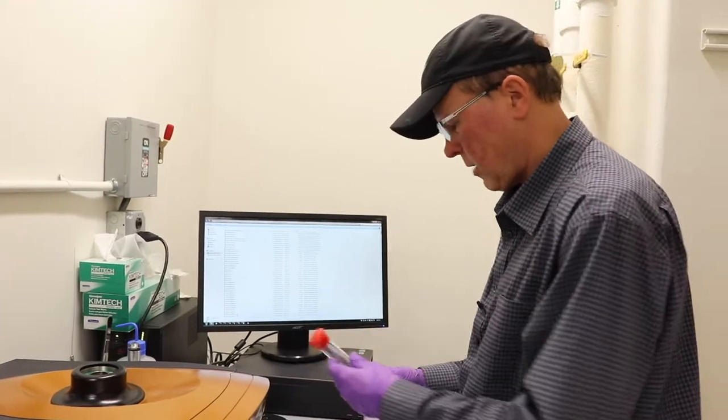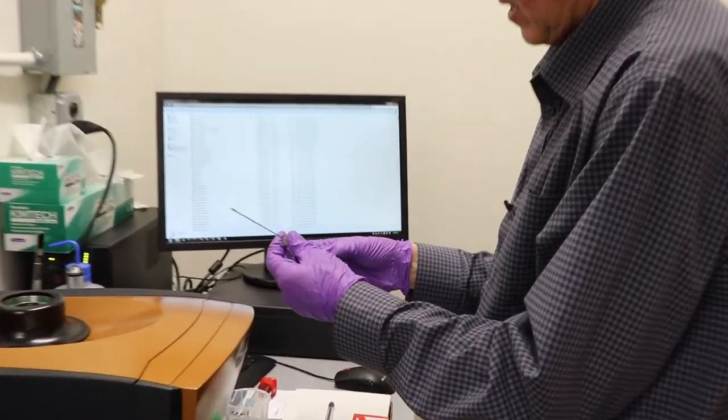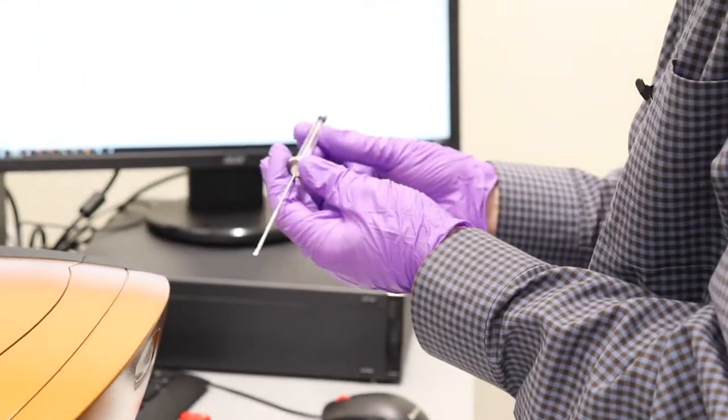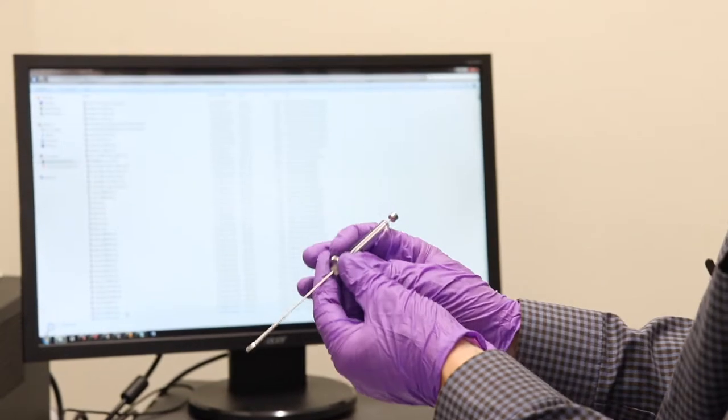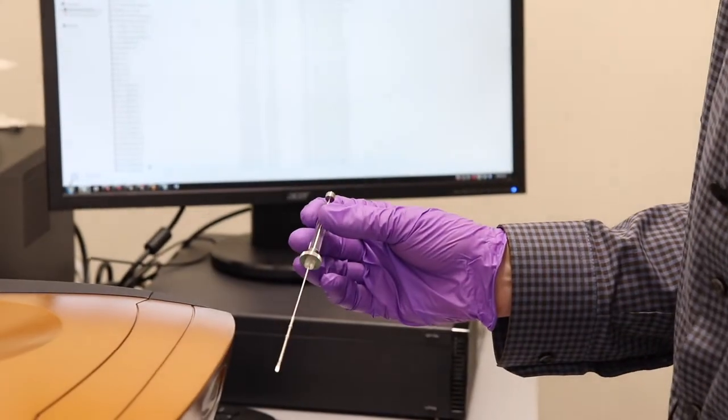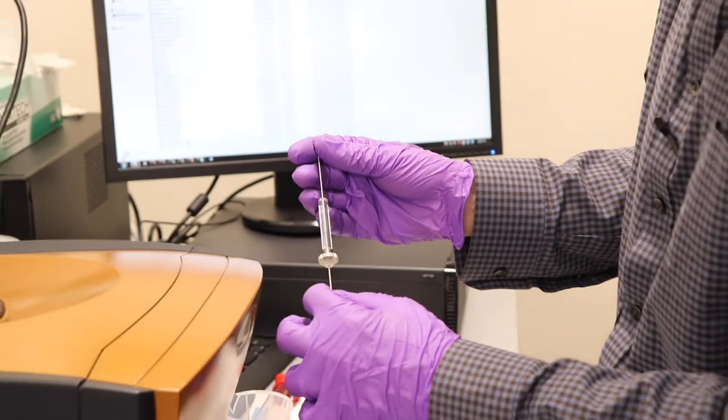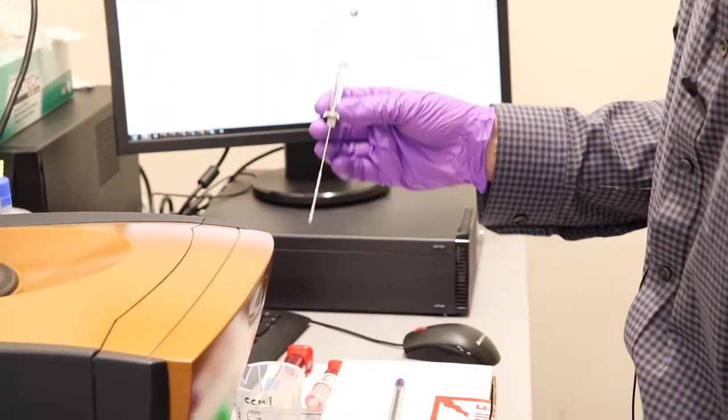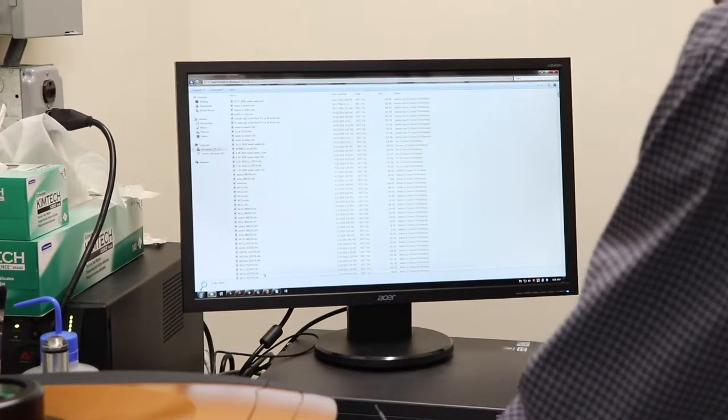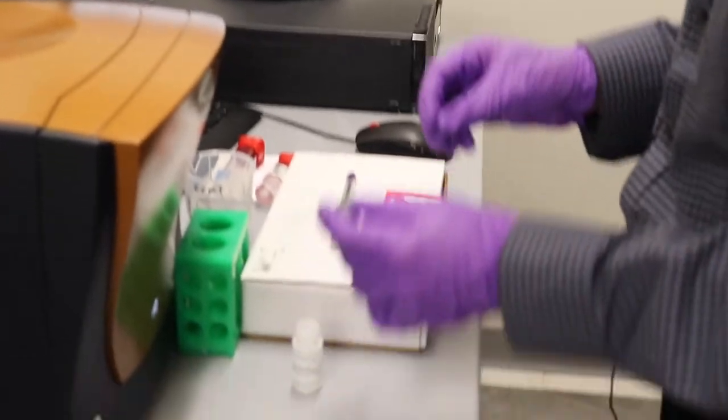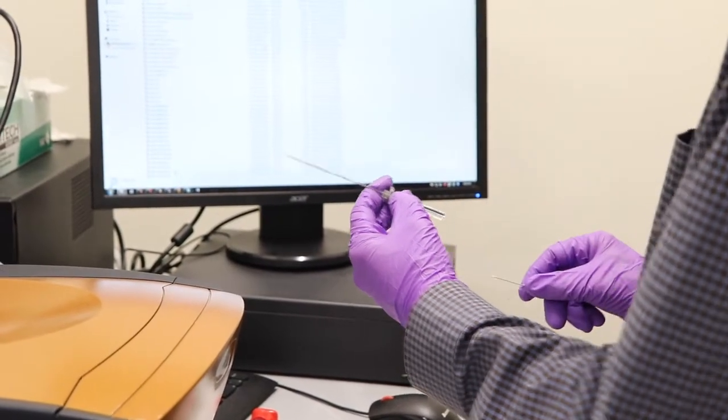Then we're going to get the titration needle ready. So this can be a little tricky. I'll show you the way I do it. Some people have different ideas of how to do it. It's up to you. Basically to make a long story short, you want a solid column of liquid from the tip all the way up to the bottom of the plunger. So it's very hard not to get air in it at the beginning. There's a way around that. So if we gently pull up, so right now there's liquid from the base to about there where we see the air bubble.